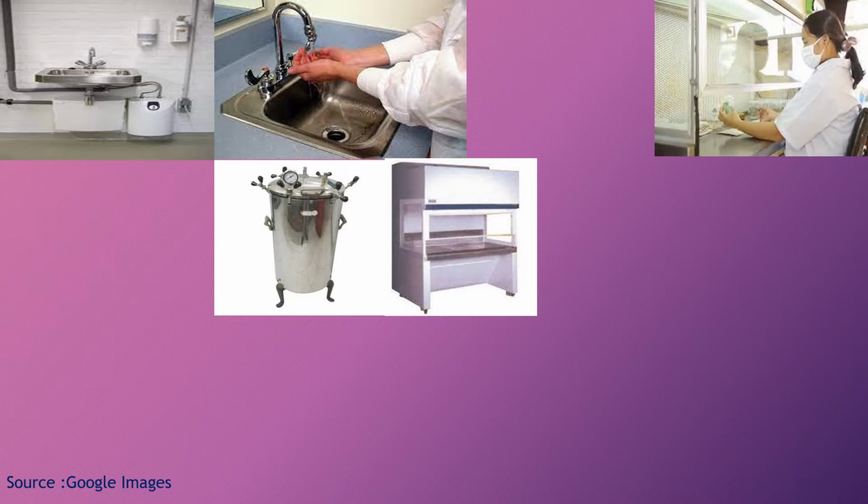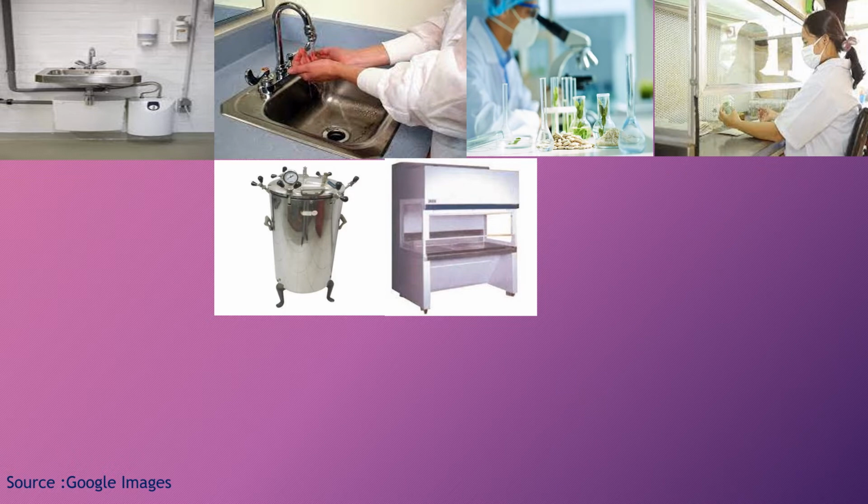Then here is a lady who is working with the plates and with the plants. She's inoculating the things over there in the laminar flow, and again observing things under a microscope while using masks and aprons and a head cap also. Head gear can also be used in order to avoid any type of contamination.